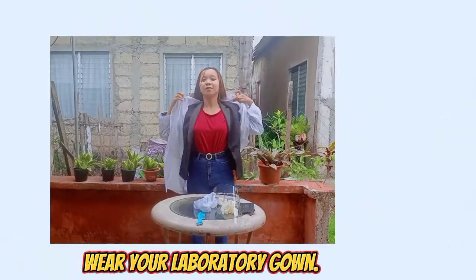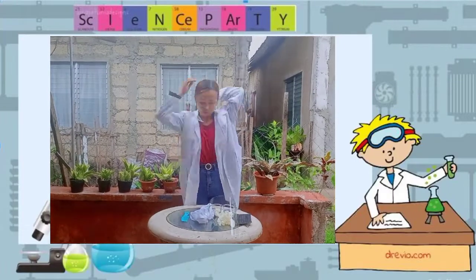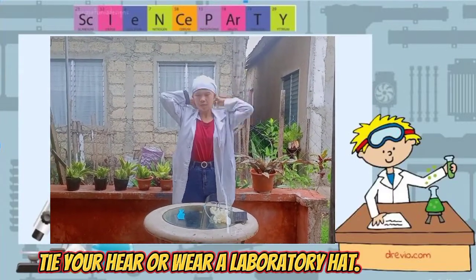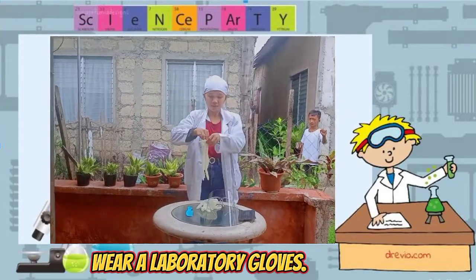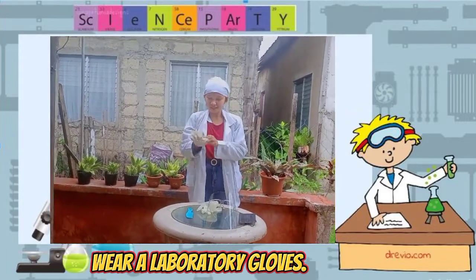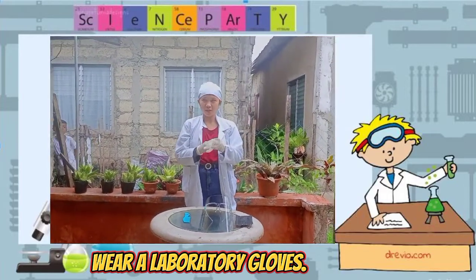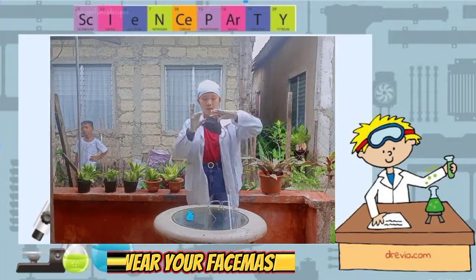Wear your laboratory gown. Tie your hair or wear a laboratory hat. Wear your laboratory gloves. Wear your face mask.